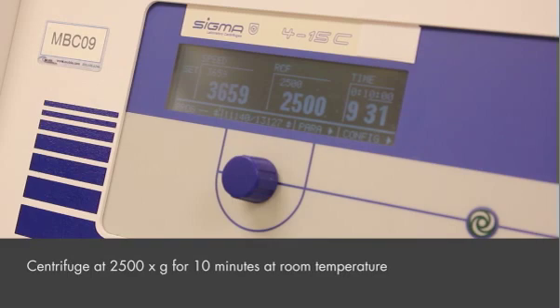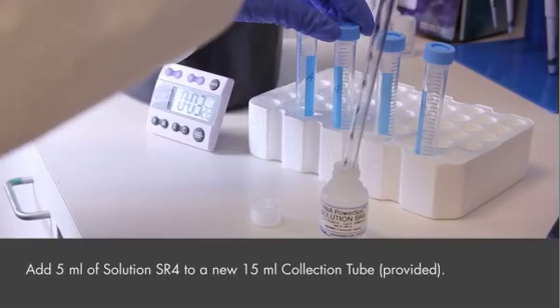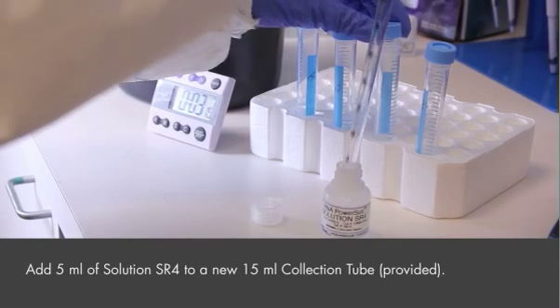Centrifuge at 2,500 times G for 10 minutes at room temperature. Add 5 mls of solution SR4 to a clean 15 ml collection tube.